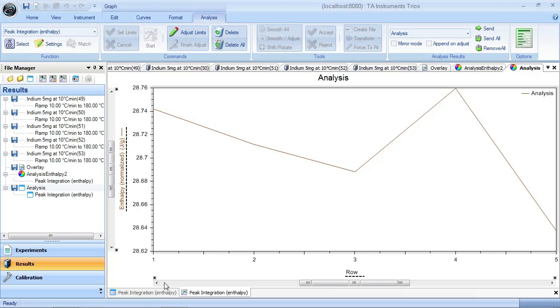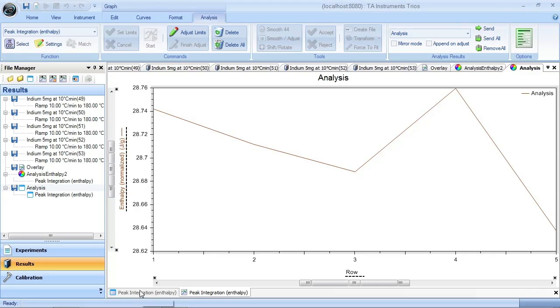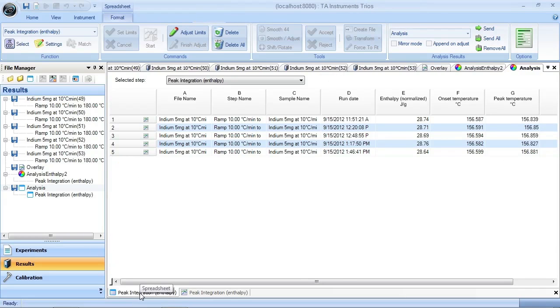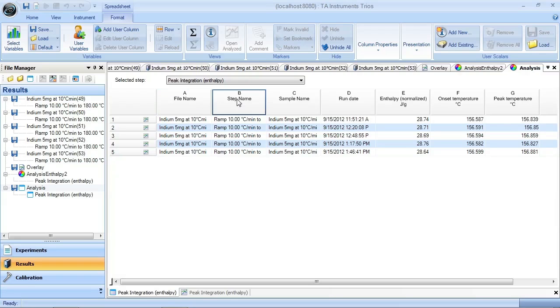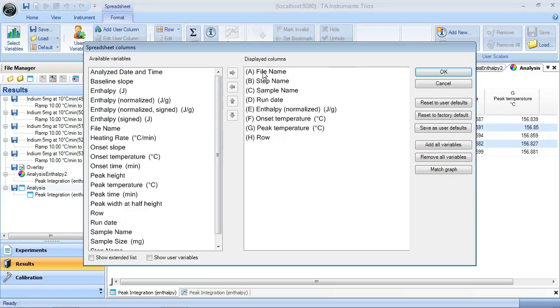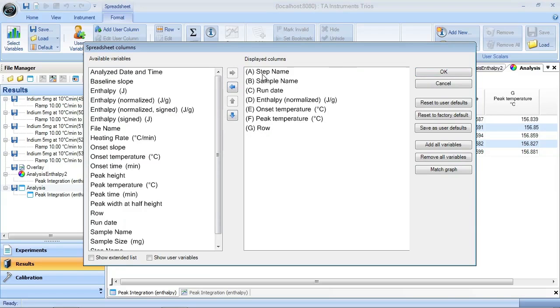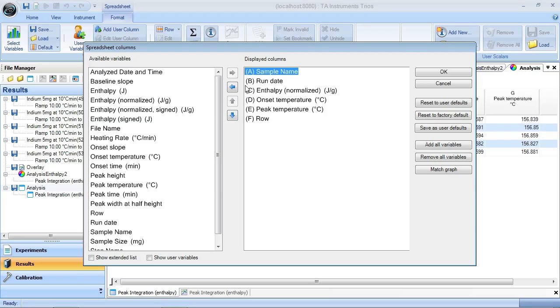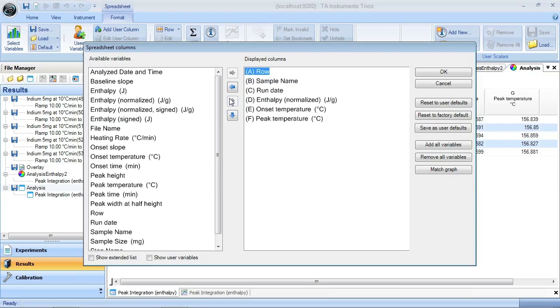Here's a graph of the results, and here's a spreadsheet showing the results. These columns are readily configurable, so you can move them around. I can right-click on them and I can say, all right, I don't want the file name, I don't need the step name. I can reorder these, things like that.